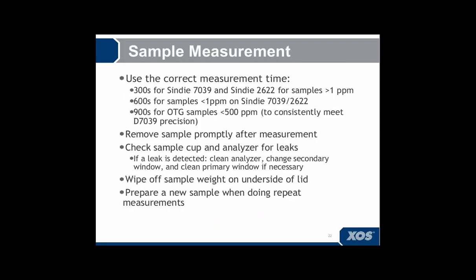Next, let's talk about sample measurement. Make sure you're using the correct measurement time. You want your measurement results to meet the precision of the stated method that you're using.